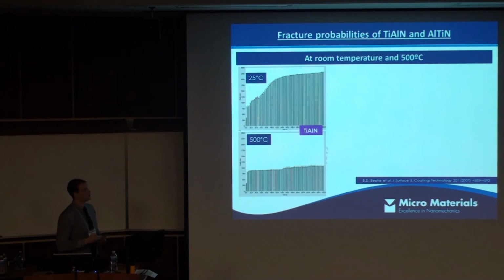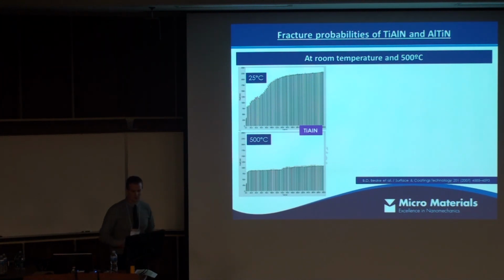At room temperature, the titanium aluminium nitride coating fails very quickly and dramatically, settling down to around 2 micron final depth. At 500 degrees, the softening of the coating has actually helped the load support in this case, so you get a much longer fatigue period and a much less dramatic failure. So the force applied to the surface can be distributed more evenly at higher temperatures.